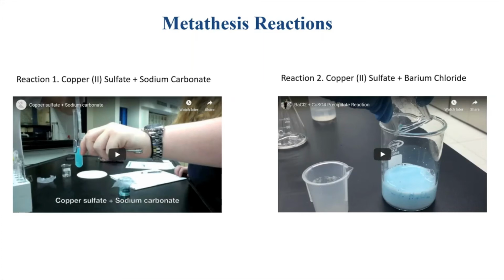Whether a solid is formed, what the color of the solid is, if a gas is formed, what the color and the odor of the gas are, and so on and so forth. So be very detailed in your observations as we go through the videos. Now, let's take a look at the first one.